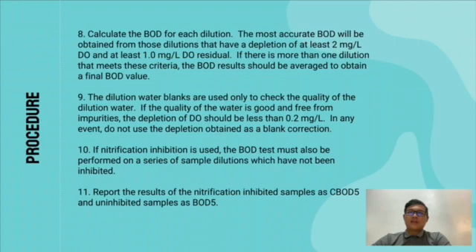If nitrification inhibition is used, the BOD test must also be performed on a series of sample dilutions which have not been inhibited. Report the results of the nitrification inhibited samples as CBOD5 and uninhibited samples as BOD5.